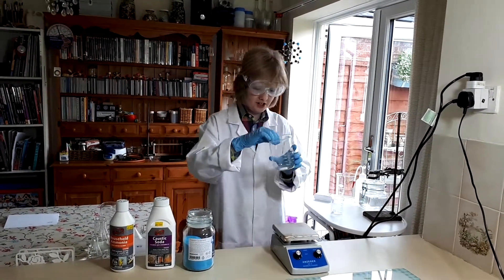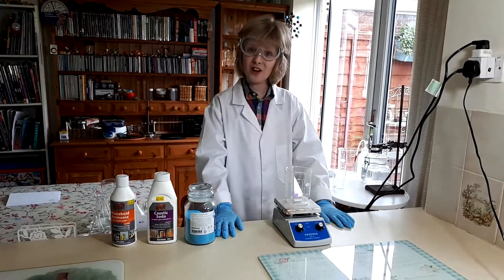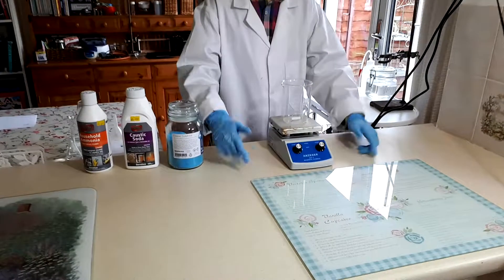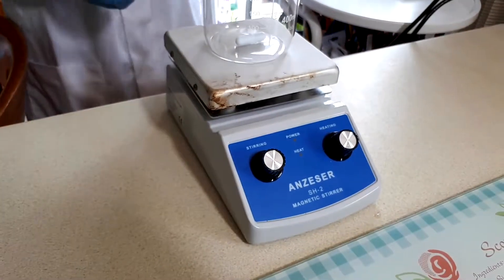I'm going to use an academy beaker for this. You might have noticed I've got a brand new hot plate stirrer and I'm really happy about it. So that's what I'm going to use today.